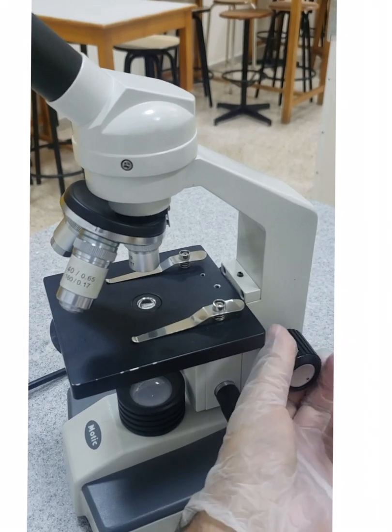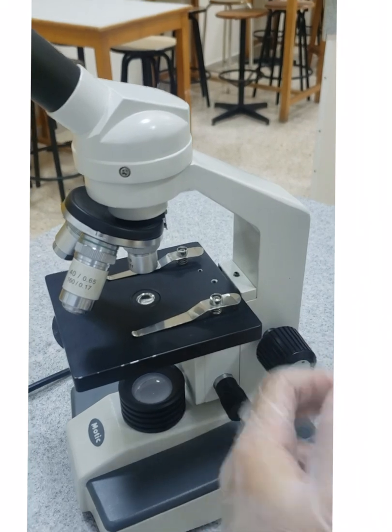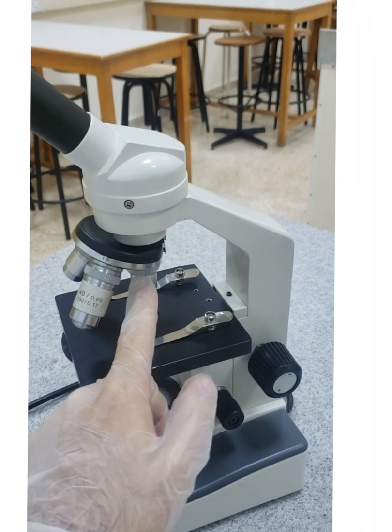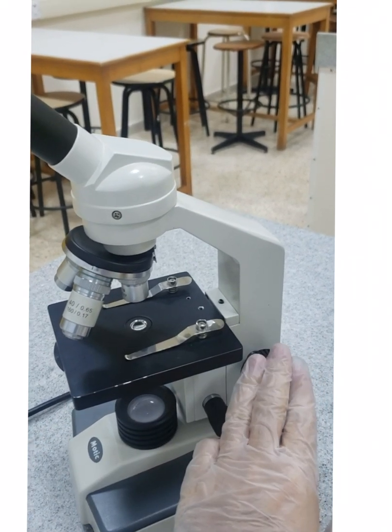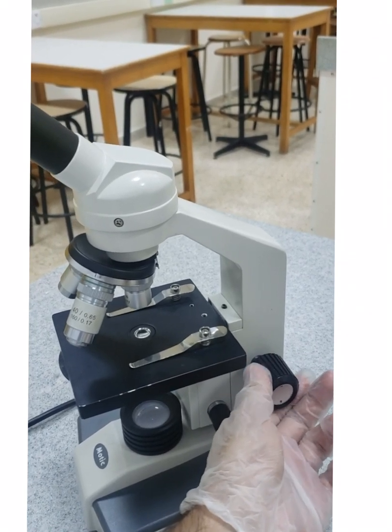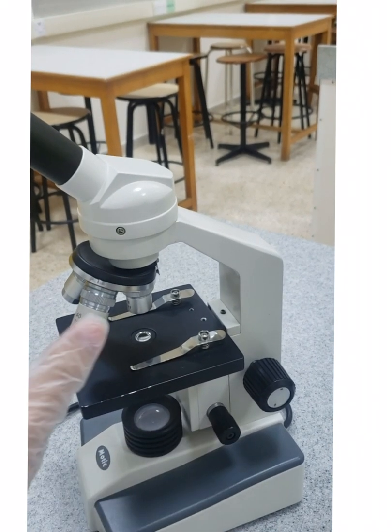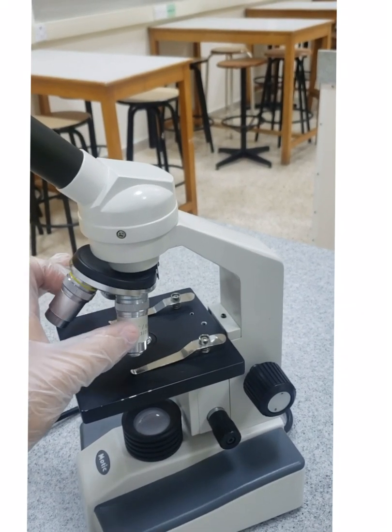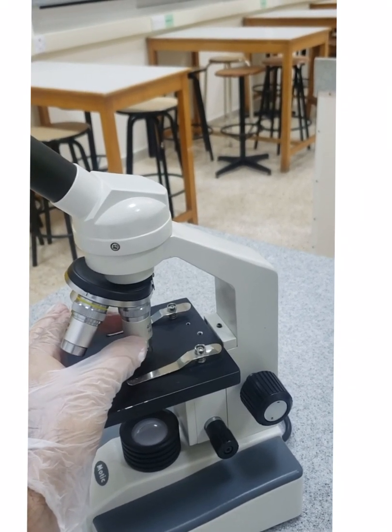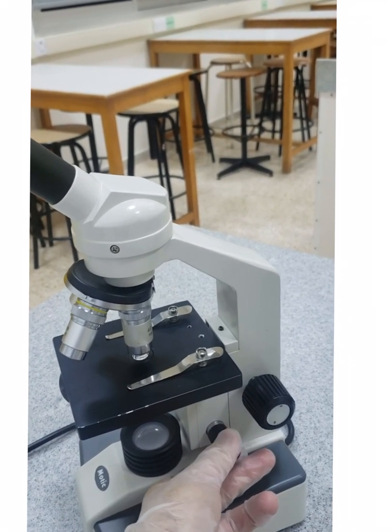Not like the coarse adjustment, it moves the stage in a very fast way. The coarse adjustment is used with the least powered objective. For example, 4 times, I will use the coarse adjustment to take the stage up and down in order to focus my picture. But the fine adjustment is used only with the highest objective lens, with the highest powered objective.